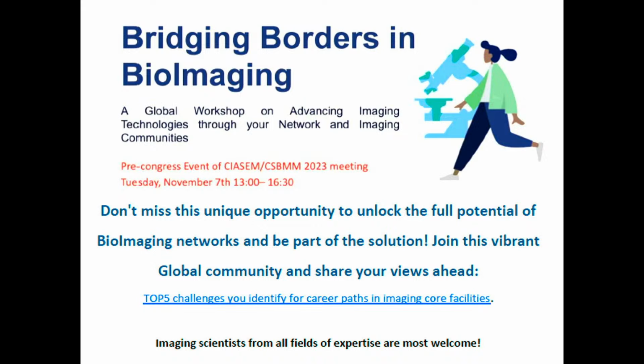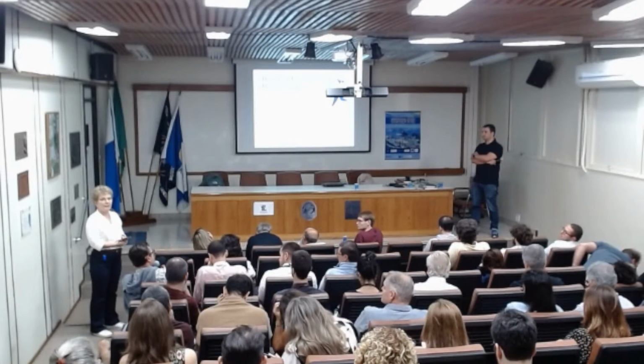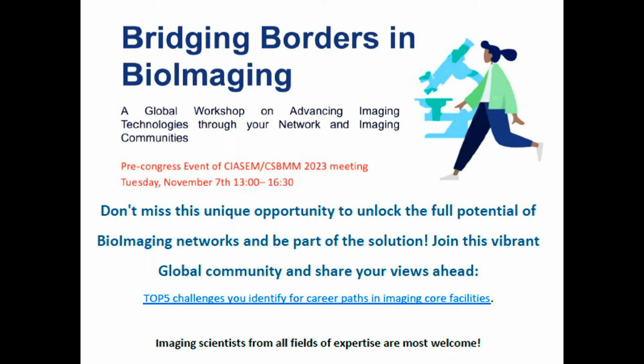So in the world of fluorescence microscopy, there is something that is coming more and more, which is the hyperspectral analysis using phasor plots to segment information from different colors. I wonder if this can apply to segment elemental composition in EM using phasor plots. Actually, I don't know if this will apply, because we have different signals.